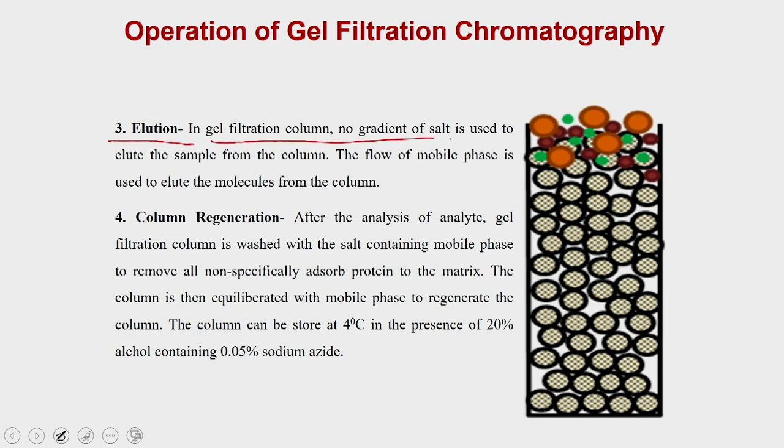Compared to ion exchange chromatography or hydrophobic interaction chromatography, in gel filtration there is no gradient of salt used to elute the sample from the column. The flow of mobile phase is used to elute the molecule from the column.